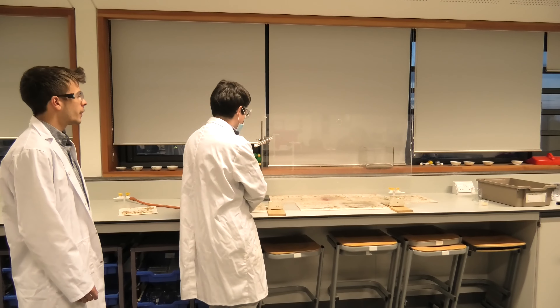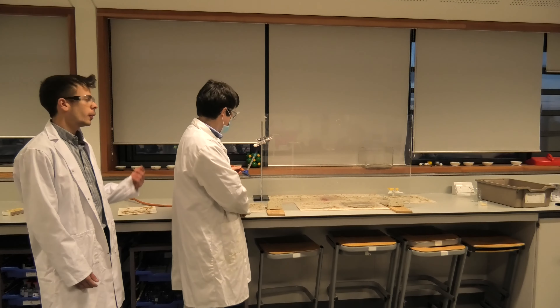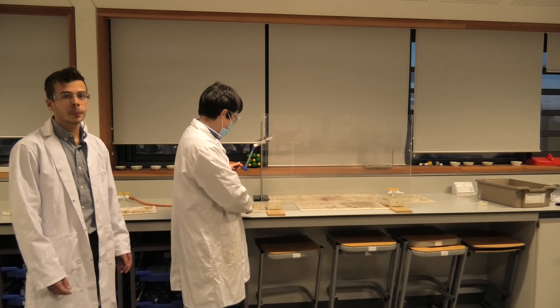This experiment shows the amount of energy contained in a jelly baby. The potassium chlorate, which is the white powder in the test tube, provides the oxygen.